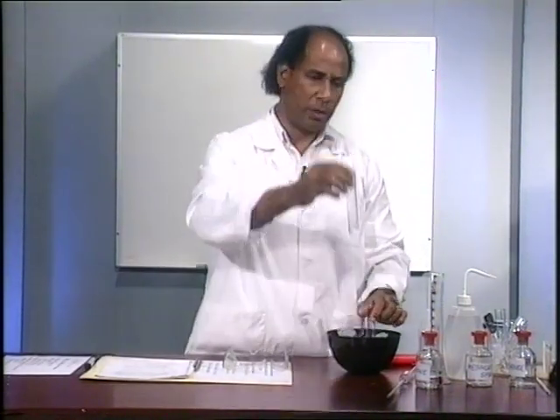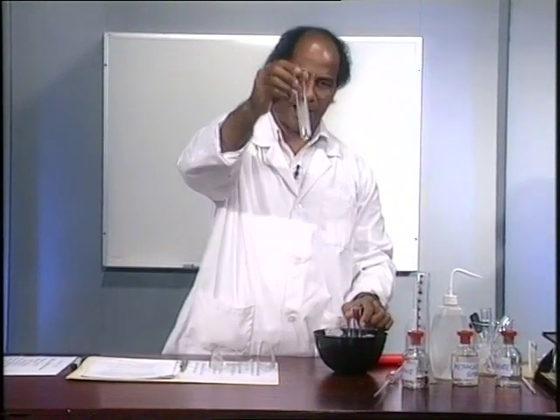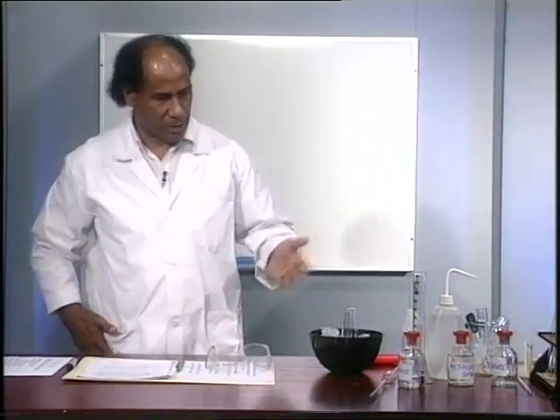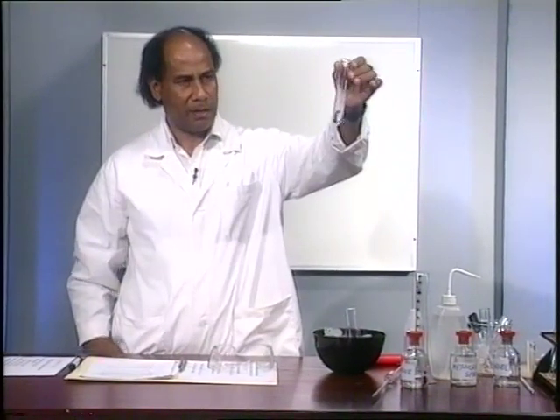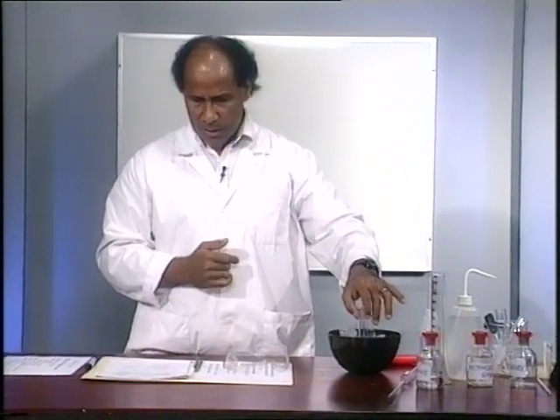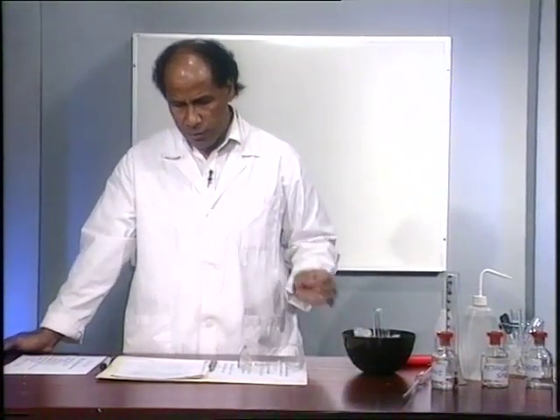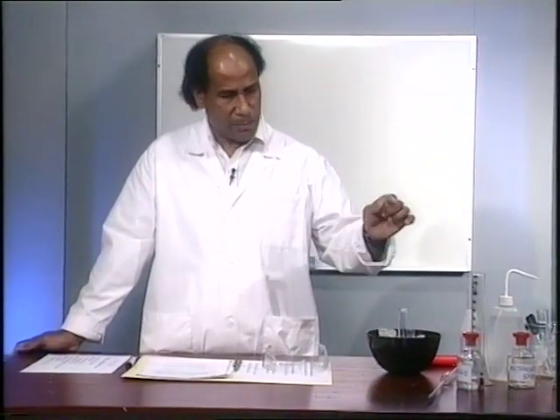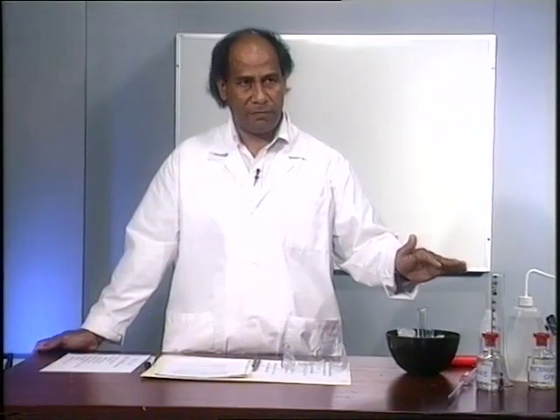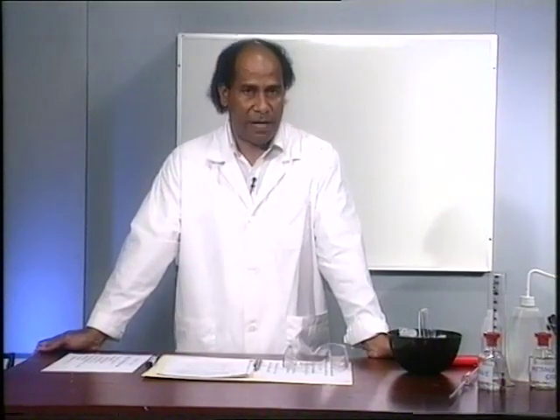Right, and the same thing with water, but I'm sure you're much more familiar with water. Okay, you've had ice cubes added to your cold drinks and so on. So this one is not a problem. Once you get that solidified, you just warm it up and see what happens. So that is how you should finish off with part 1, to try and note the visible differences between the two solutions and relate these differences to the presence or absence of hydrogen bonding.